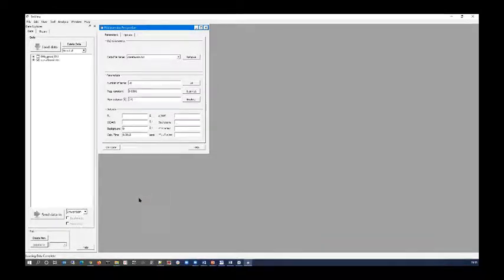There we go. So I don't think I need to explain what P of R inversion is all about, except to say that the way that SasView does things under the hood is subtly different to the way that Otto was showing this morning. But at the end of the day, they ought to give, I would hope, similar answers. If you're listening, Otto, maybe we should try this one day.